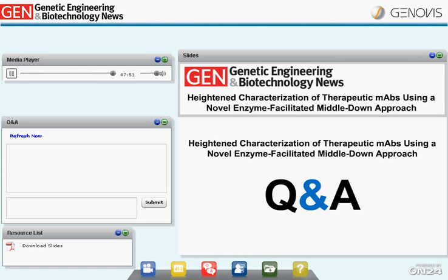All right, Frederick, we have more time and some more questions coming in for you. Are you developing enzymes capable of preparing F(ab')2 or Fab fragments from rat IgG1 and mouse IgG1? We are, of course, looking into this. We have nothing that is really close to being launched at the moment for that type of task, but this is something we are currently working on.